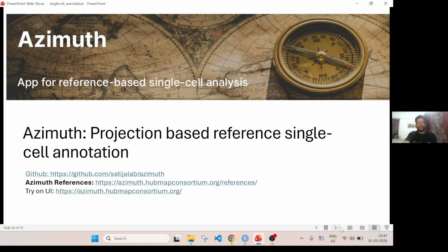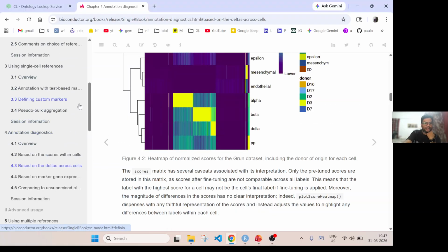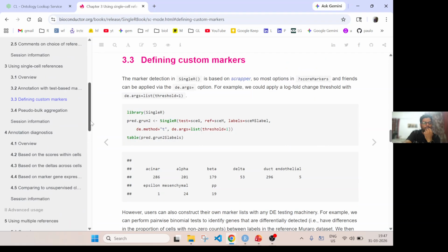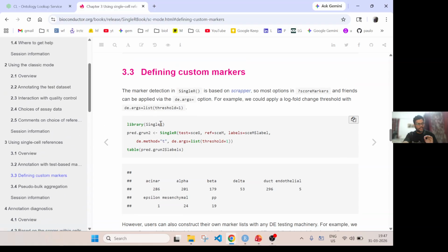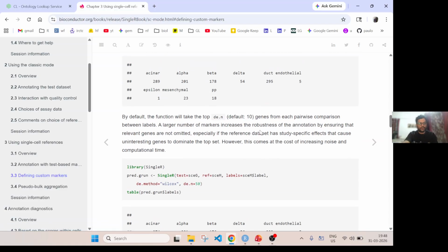Okay, so with that, I think SingleR is a very nice package. I would recommend you go through their book, and they have some other information as well. For the details, it would be very difficult to cover everything, but this gives you an idea. The method is very simple, a one-line command, but the concept is that the reference you're using must be log transformed, and your query can be anything. You just compare, do the correlation-based analysis and some plotting, and that will give you information.